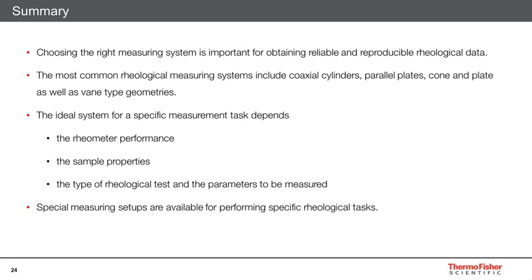Besides the standard rheological measuring systems, there are a lot of special measuring setups that are used for performing specific rheological tests. This includes setups for dynamic mechanical thermal analysis, extensional testing, tribology, as well as interfacial rheology.